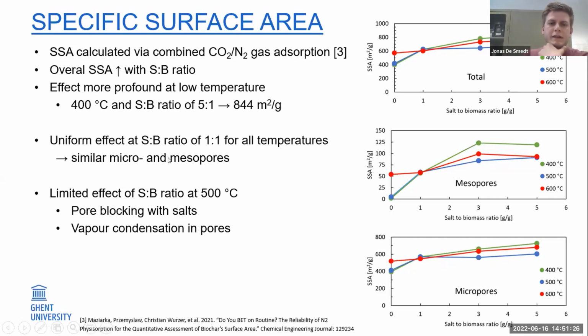And the most limiting effect was observed at 500 degrees Celsius. There you can see from the micropore surface area that we have more or less a flat line around 600, regardless of the amount of salt that was added.